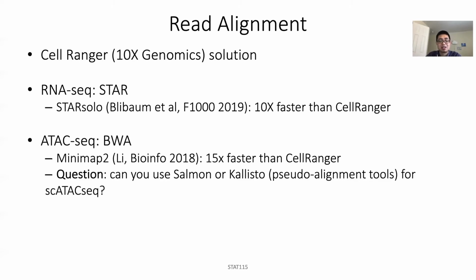And using that, you are still able to do clustering, finding new clusters. But again, any reads that are not aligned into those publicly available potential open chromatin regions will be missed. So you can still use it, but then you lose some information.